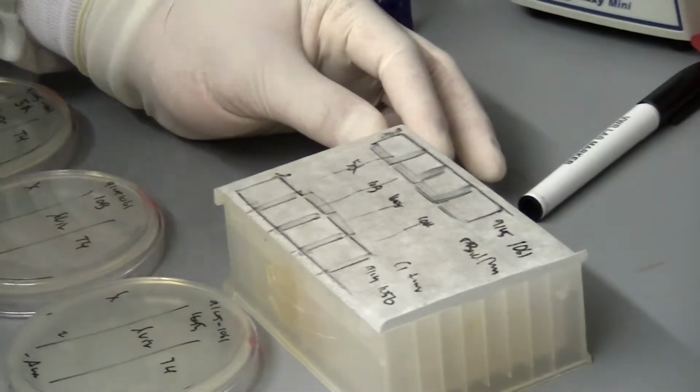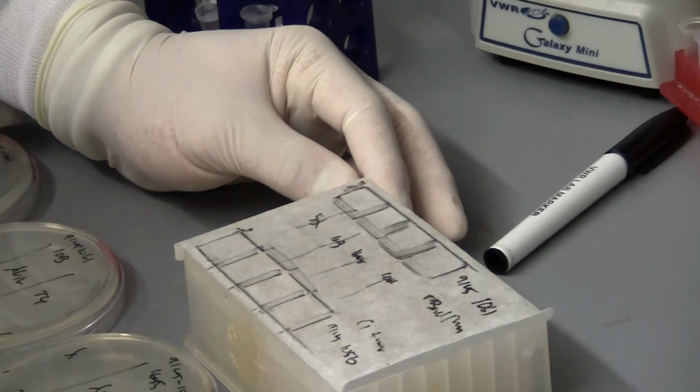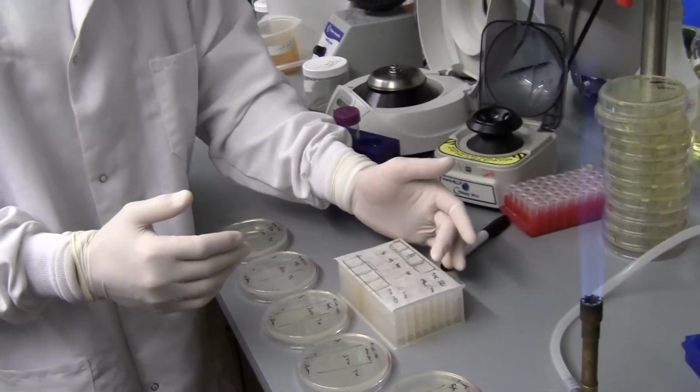Inside of our E. coli, we have an inducibly expressed IM gene from T4. It's under the PBAD promoter. That means when we add arabinose, we will get this IM protein from the T4. And if we don't add arabinose, we will not get that IM gene.